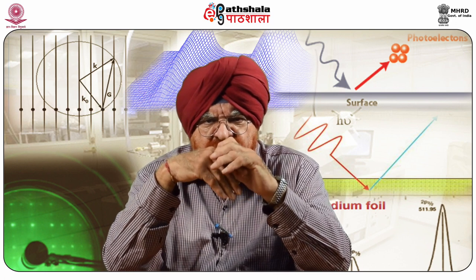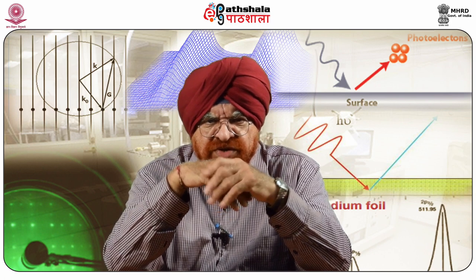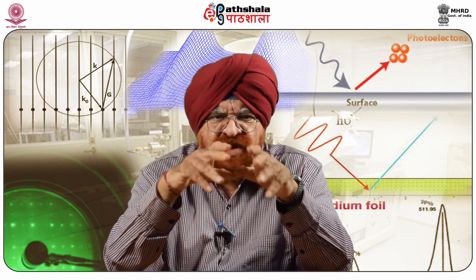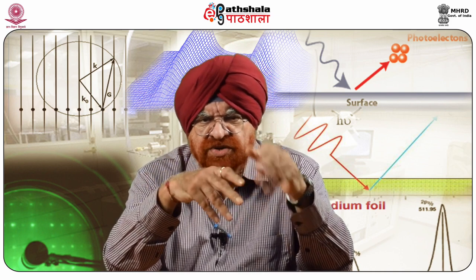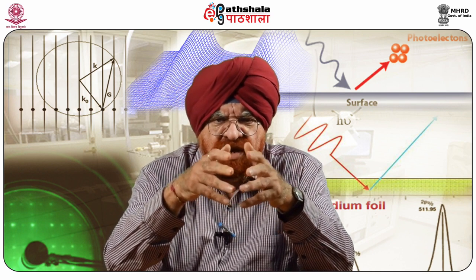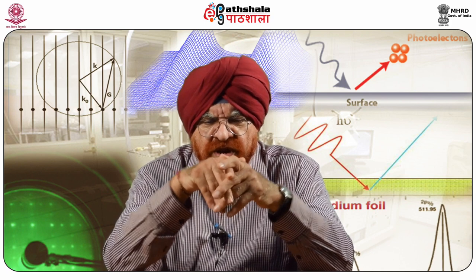The information XPS provides about surface layers or thin film structures is important for many industrial and research applications where surface or thin film composition plays a crucial role in performance, including nanomaterials, photovoltaics, catalysis, corrosion, adhesion, electronic devices and packaging, magnetic media, display technology, surface treatment and thin film coatings used for numerous applications.